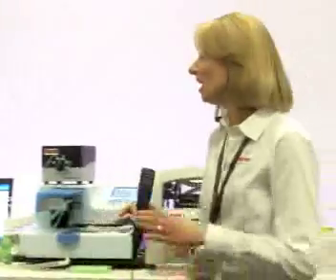Thank you very much, Tim. Hi, what I'd like to talk to you about today is the Thermo Scientific RapidStack Microplate Stacker that we have paired here today with a Thermo Scientific Multi-Drop Kombi, as well as a Multi-Reagent Valve.